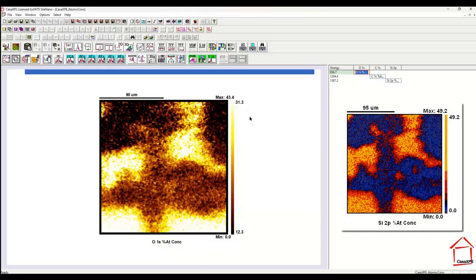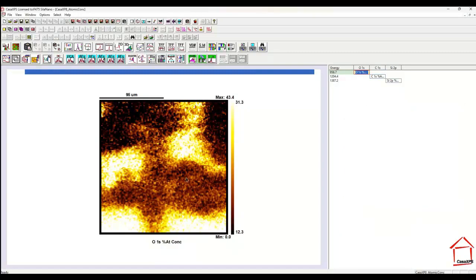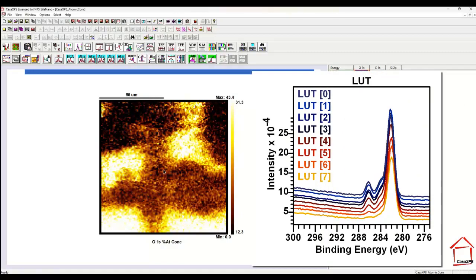In this video I'm going to create a false color image that consists of 8 colors that highlight the different zones within an image that have similar intensity. And then using that false color image I'm going to create spectra from the data set of images.